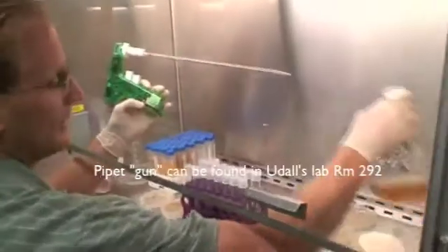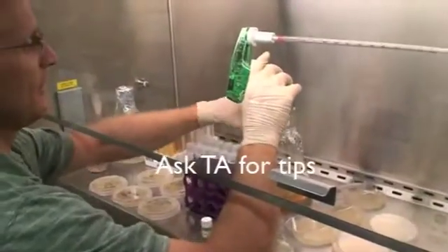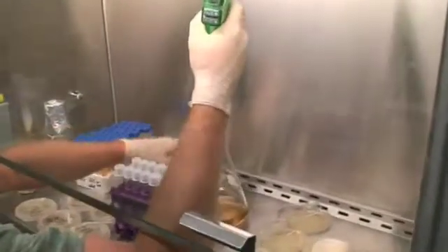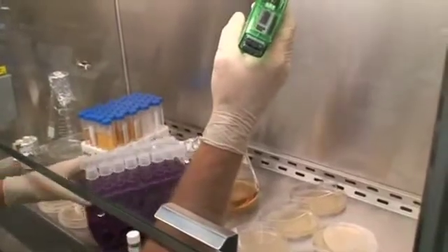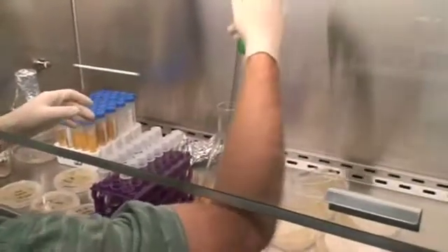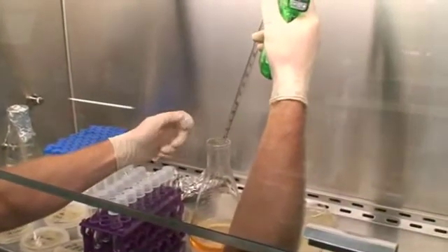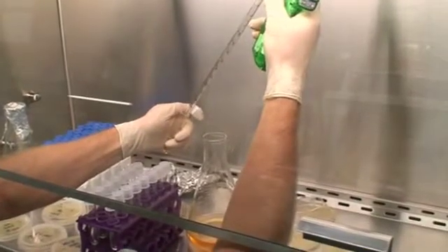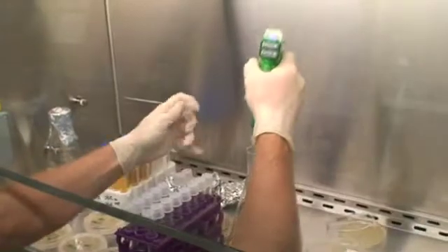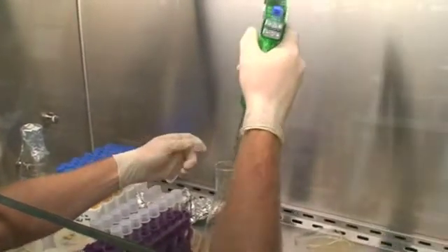So this is my LB media — it's not LB agar. I'm trying not to touch this tip anywhere because I don't want to contaminate my media. What I'm doing here is I just need to put in five milliliters into each tube and let that incubate overnight. There's five — I'm a little out of practice with this. It's five milliliters plus or minus half a mil, really.